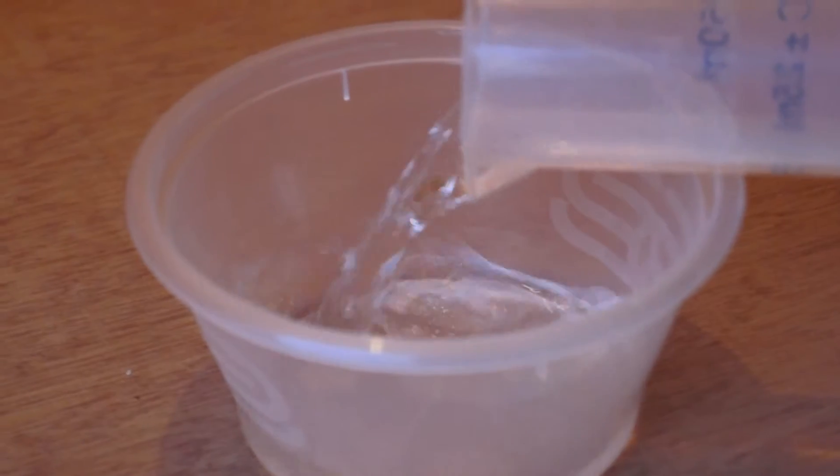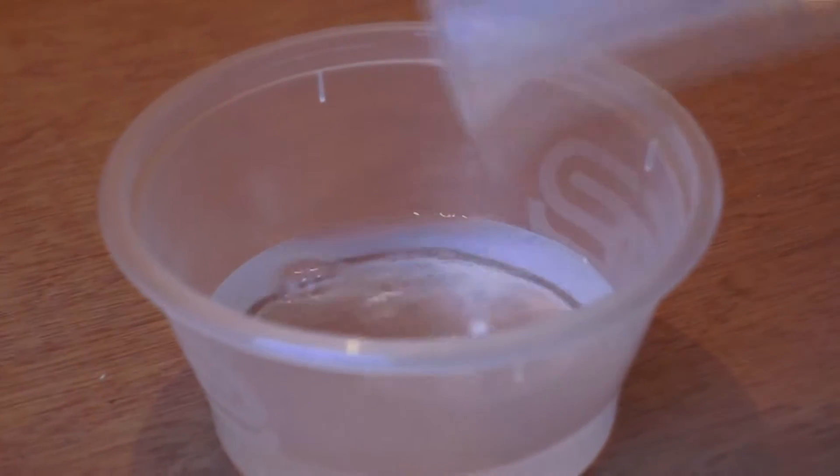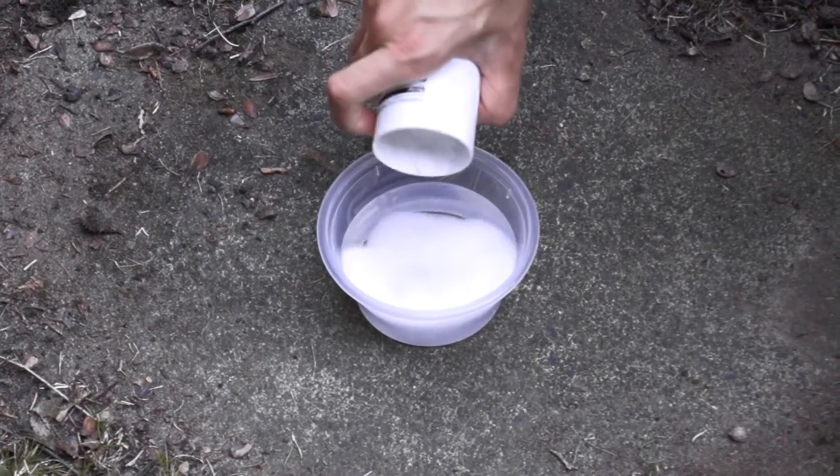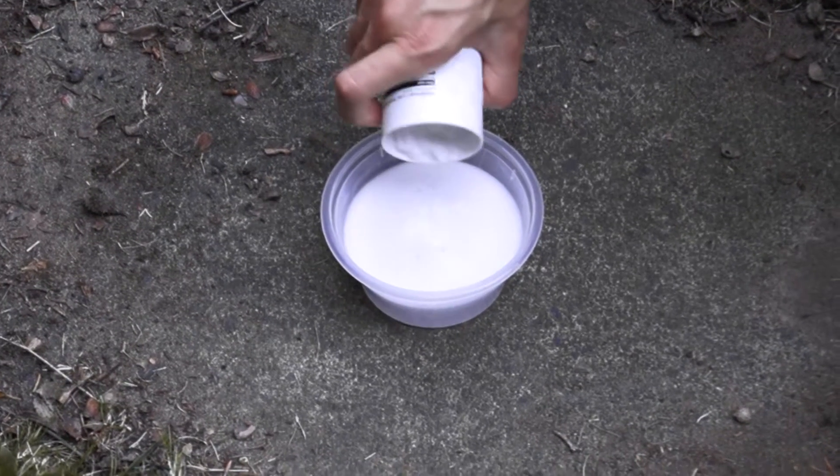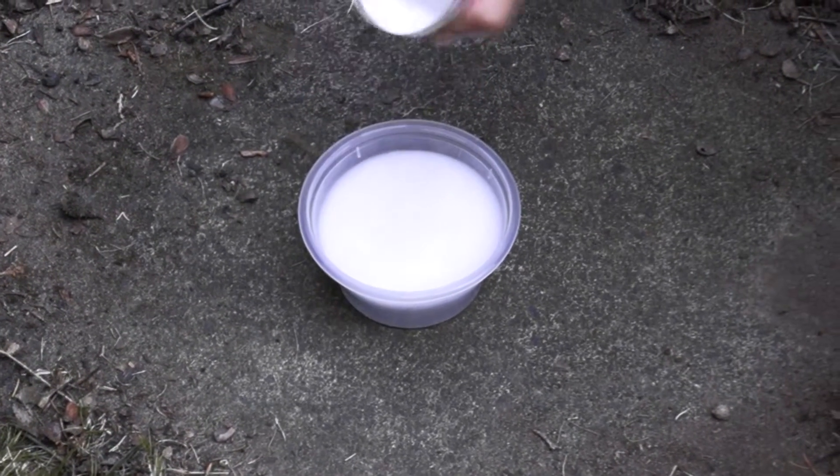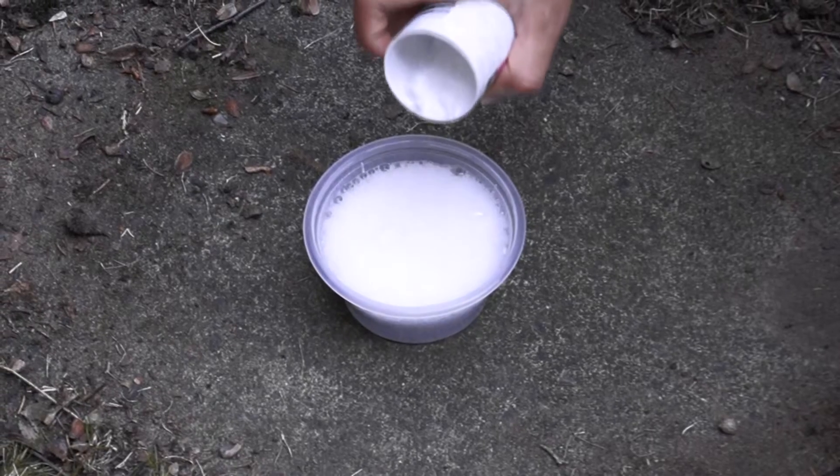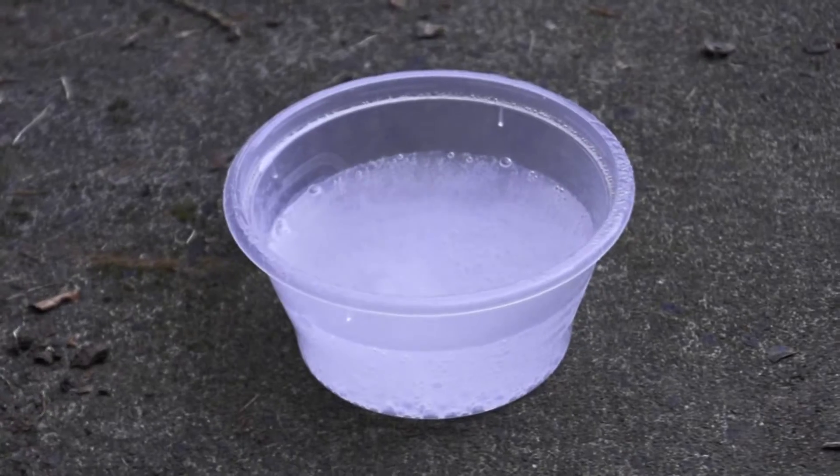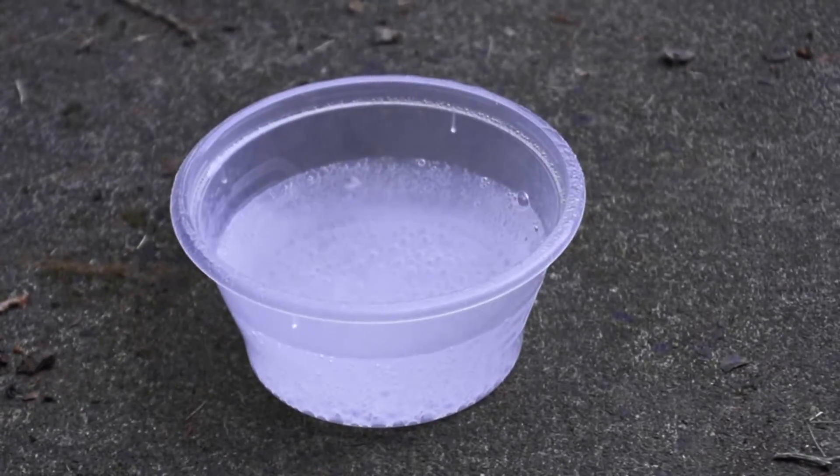Firstly you will need to measure out 200ml of vinegar. Pour this vinegar into your plastic bowl and take this bowl to a place where you don't mind a mess being made, I did mine outside. React the acetic acid in the vinegar with the sodium bicarbonate. You should keep pouring in the sodium bicarbonate until all of the acetic acid has reacted. This could take a while.